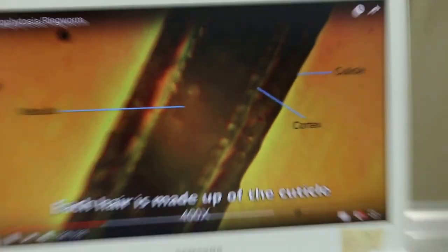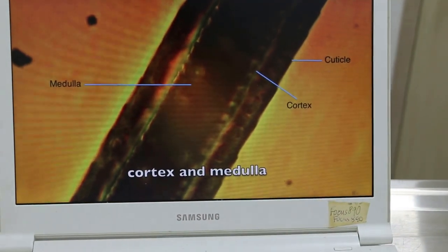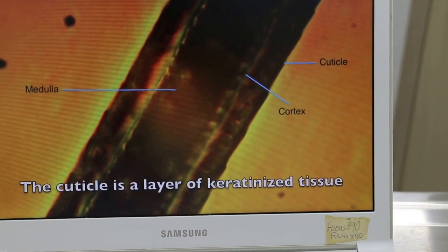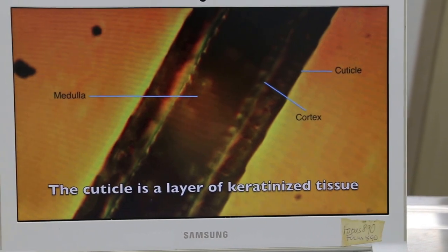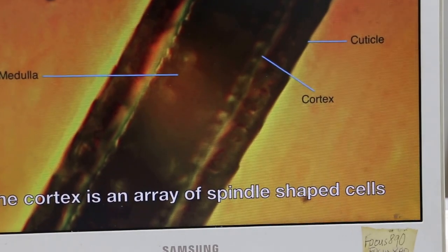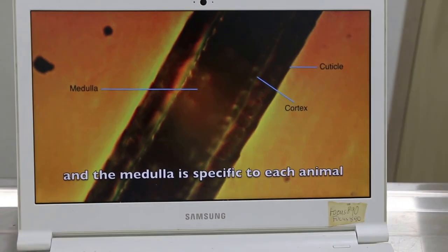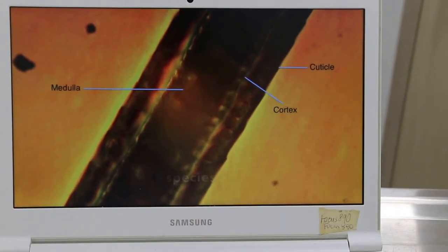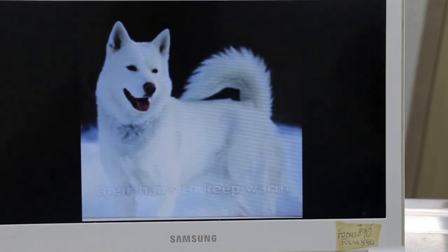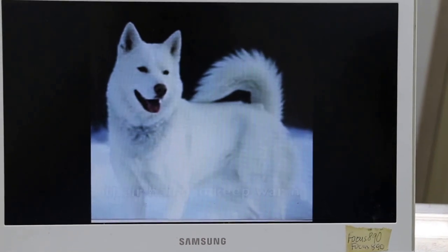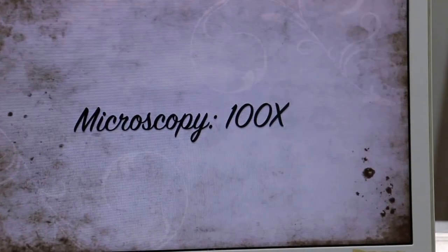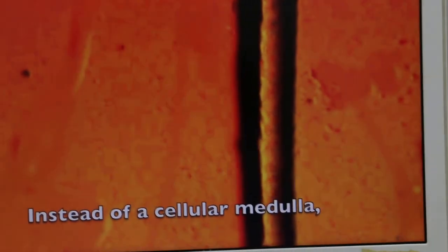Look at this video. It's produced with PiVex, done by one of the interns. We'll just continue on the microscope at 100 times magnification.